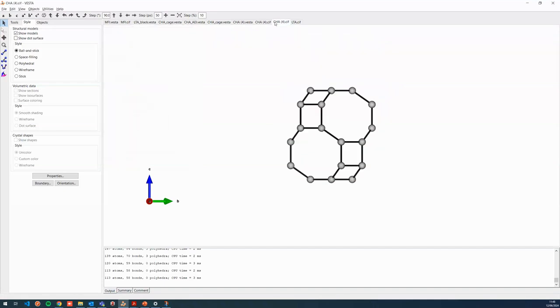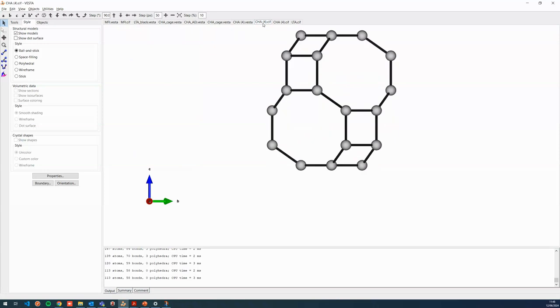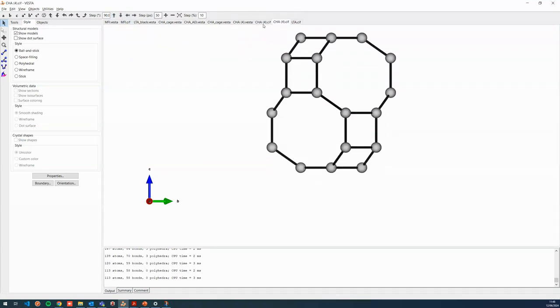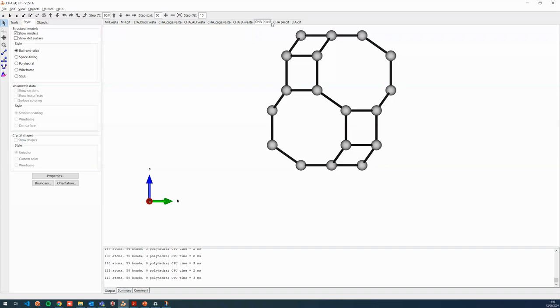Let's keep it at 40. It's fine for me. And here, let's put it also at 40. Yes, and there you go. Okay, you see it's a bit more to the top. Don't worry, I gotcha. You see, we created the same figure two times using two methods.